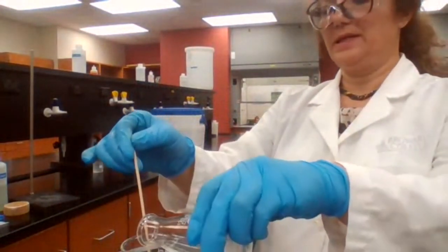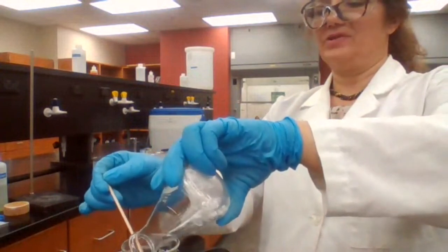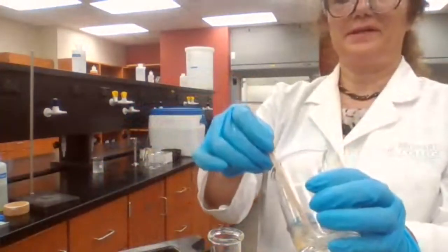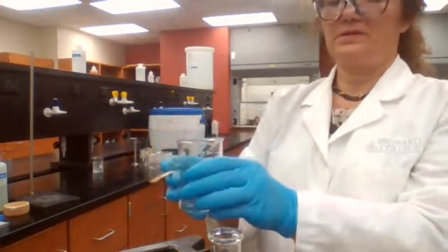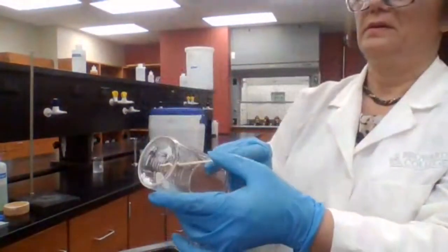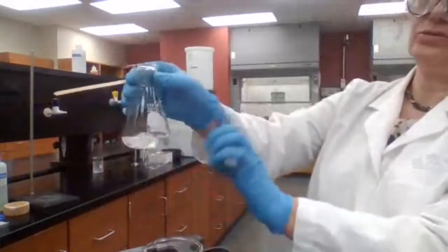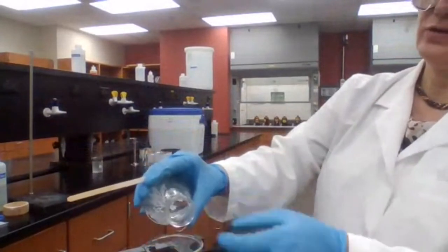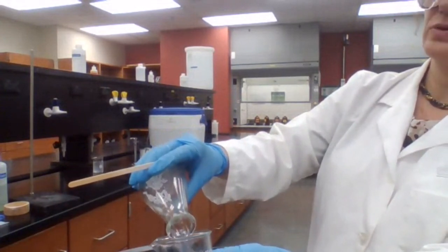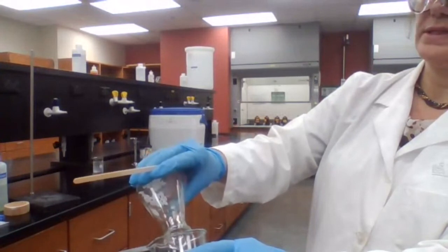Transfer the liquid portion only. Basically, you're decanting, meaning that you transfer the liquid without getting any of the solid. And if that happens, it's just bad lab technique, so you have to repeat yourself. I was trying to get the last drop of it, and these pieces of calcium chloride went in. I don't need them there. I only needed to get the moisture out. So now I have to be more careful. And it was good that it was showing at least we have some calcium chloride that did not react. So that means the water was absorbed completely.